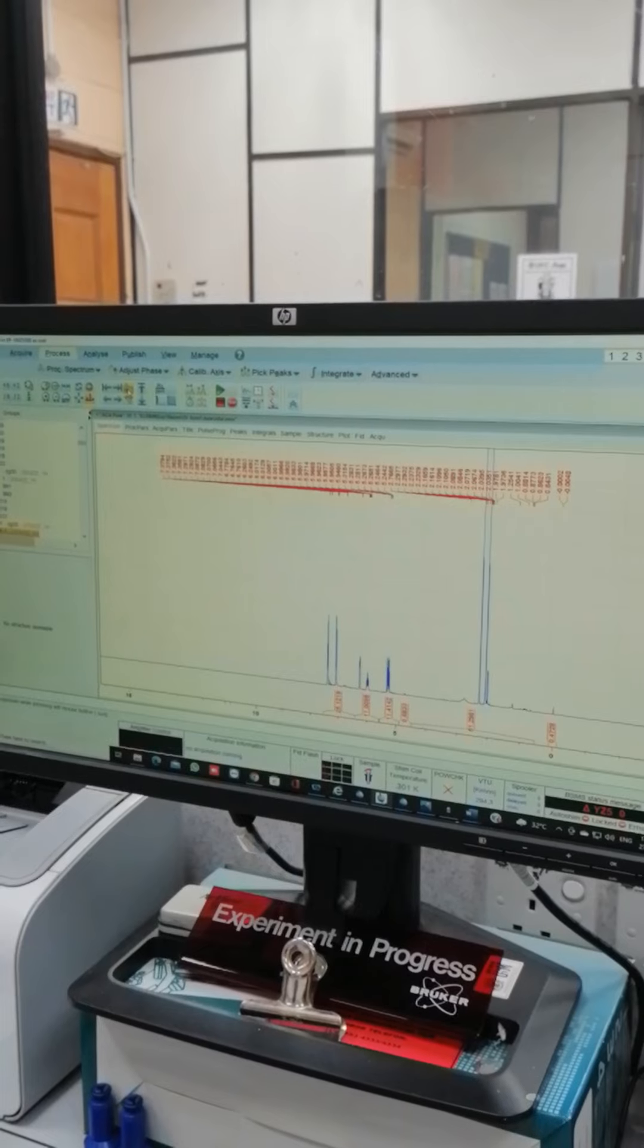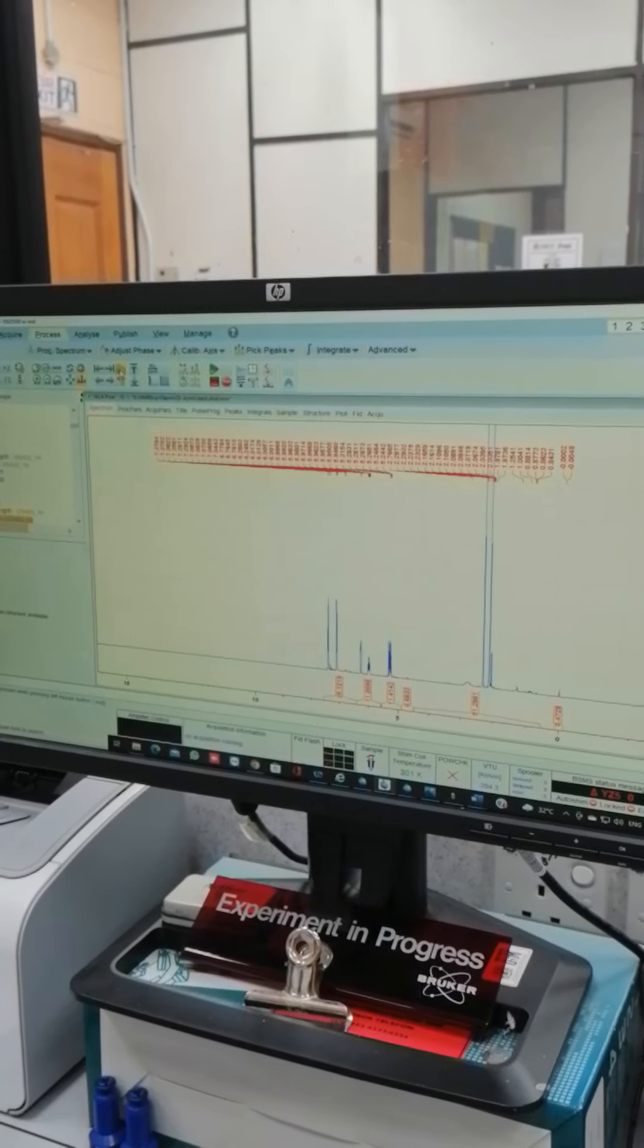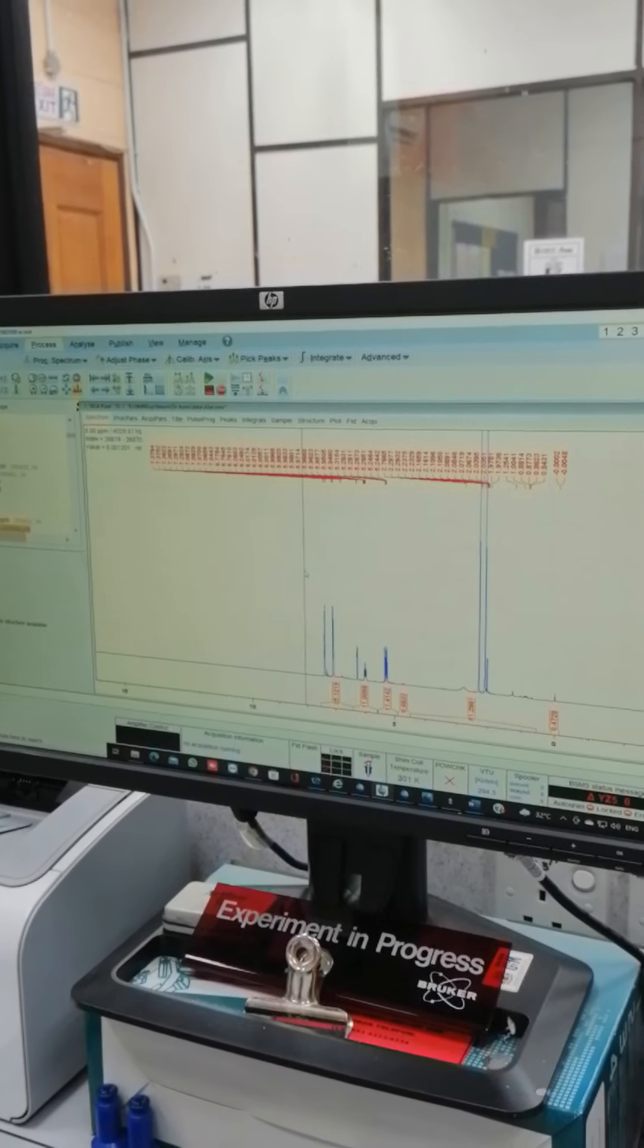So we finish measuring the specimens. We proceed with the processing. This is the NMR spectra that we get during the measurements.